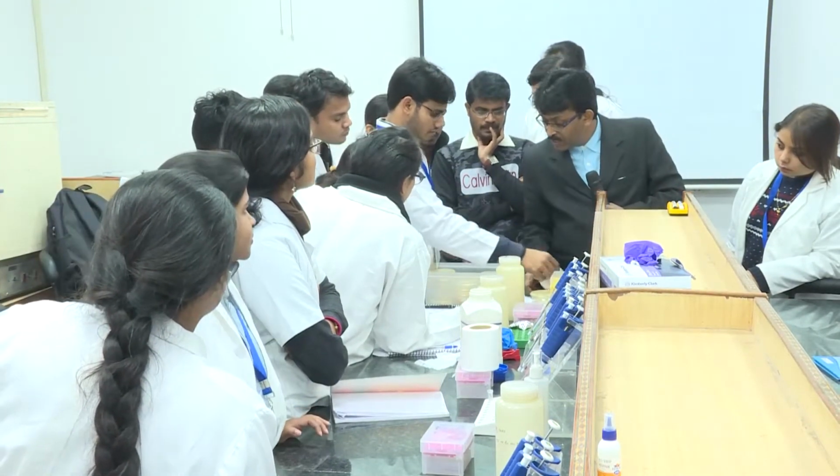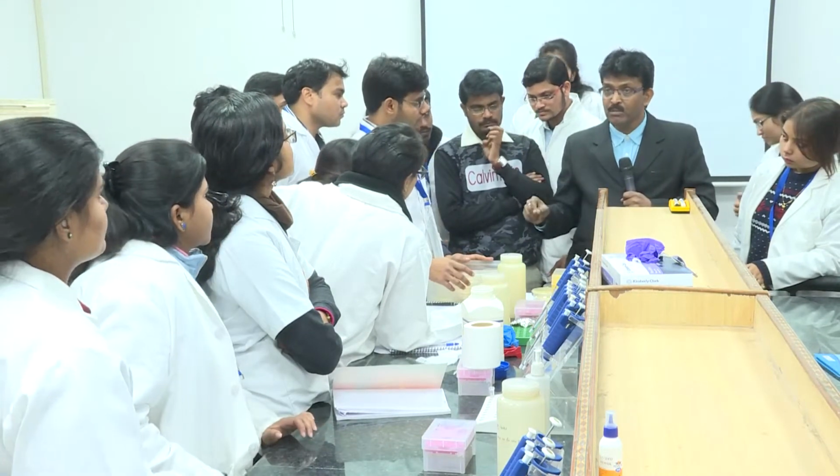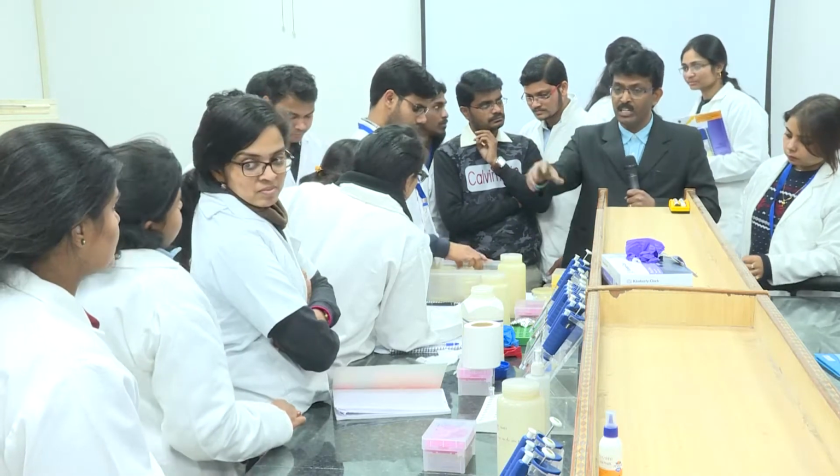Now each group, pick your plates and observe whatever you are seeing, and record that in your notebook.